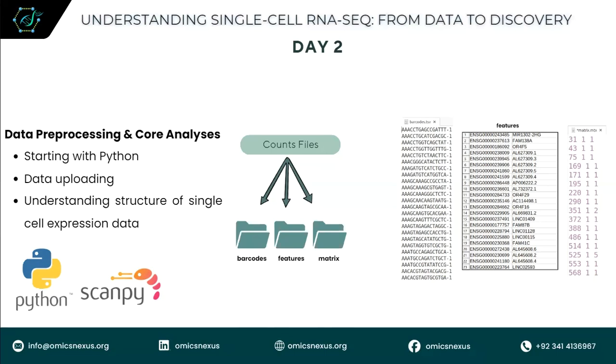What we will do is that you will be analyzing the data in parallel, meaning that hands-on training will be given to you. We will be analyzing the data, and plus we will also be giving you time to analyze the data. And all the training will be completely hands-on. So we'll start with Python, how to upload the data, the expression files, and we will be guiding you through understanding the structure of the single cell expression data, how the data is arranged, what is inside the files, and how we can visualize it. So this is the most important part in day 2.